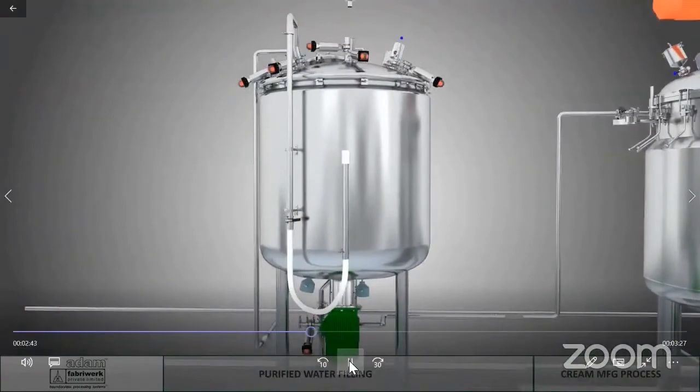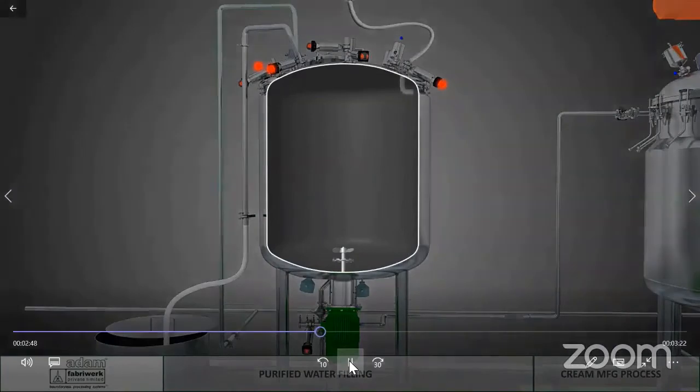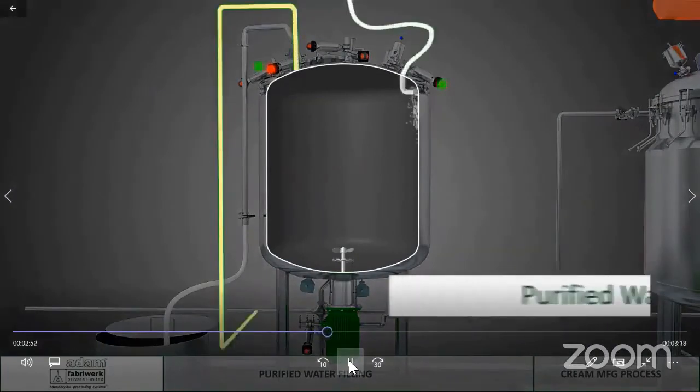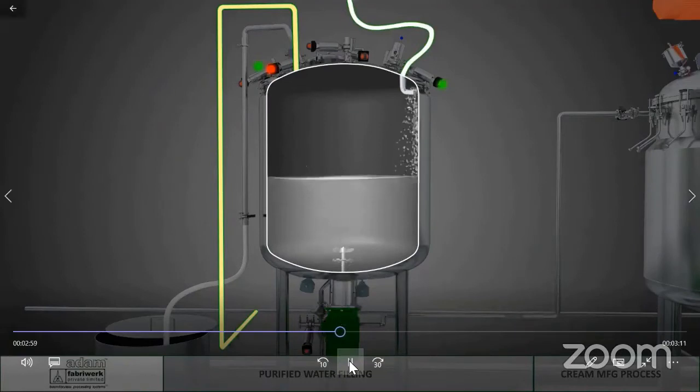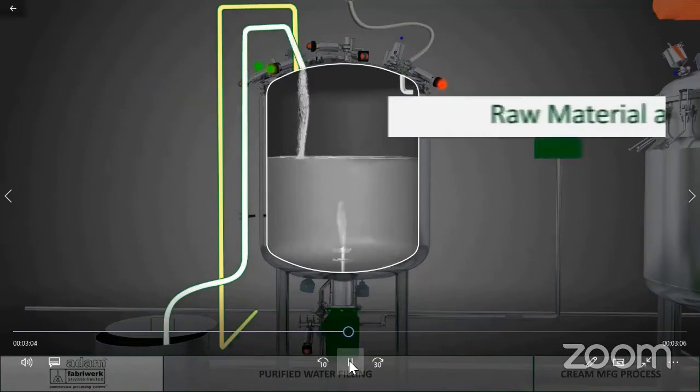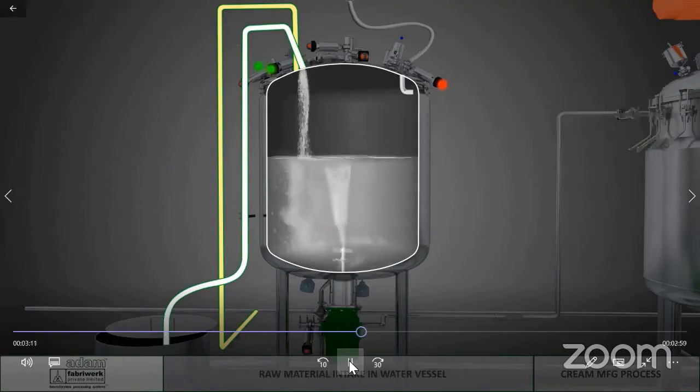The water phase vessel also works on the same principle. Water is taken into the vessel and then specific carbomers are added into the vessel and dissolved into the water through a bottom sawtooth cutter, a propeller, or a high shear mixer as the case may be. All mixer configurations are customized for specific operations. Again, the advantage of transfer by vacuum cannot be replaced by any other mechanism.